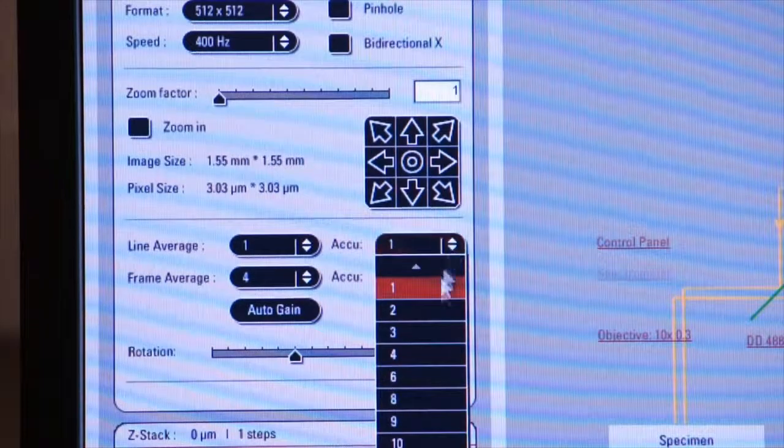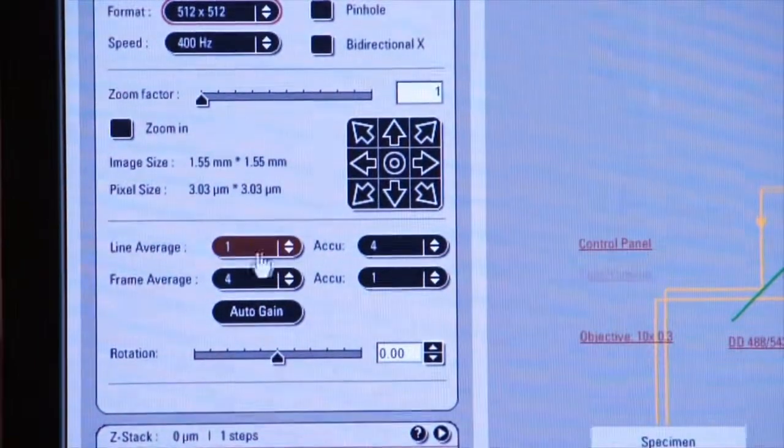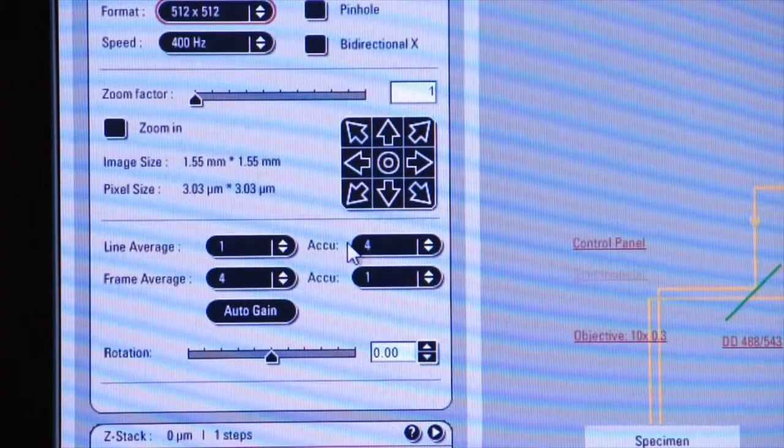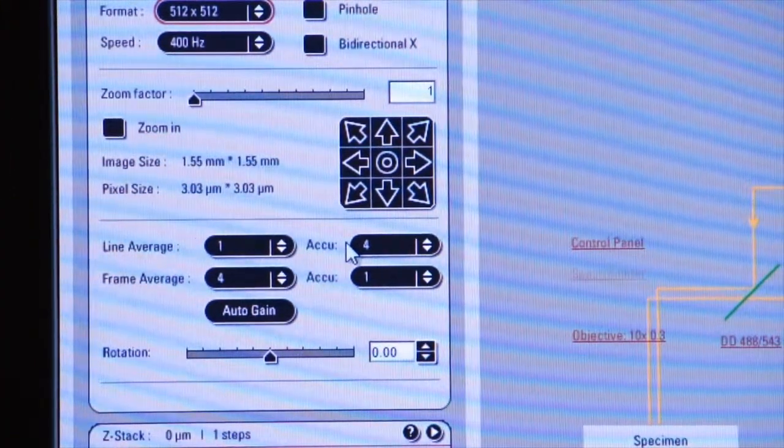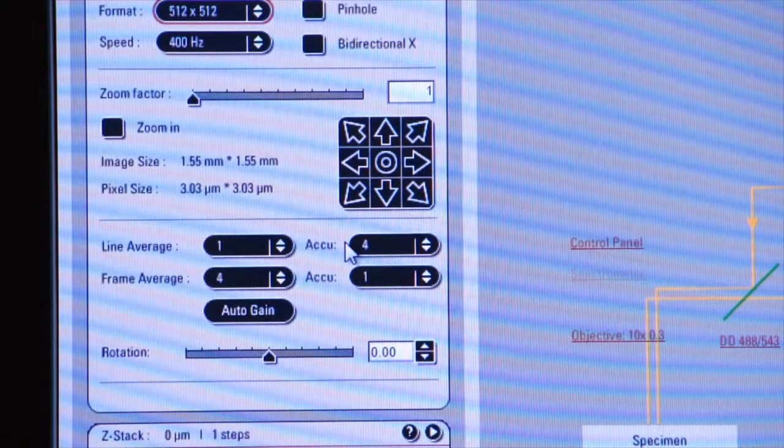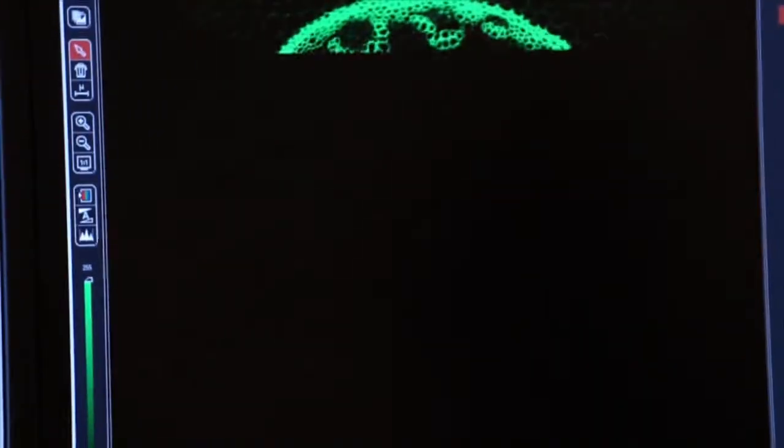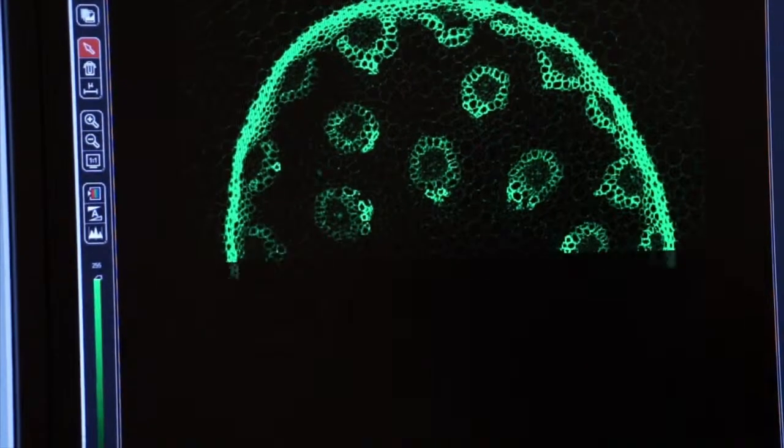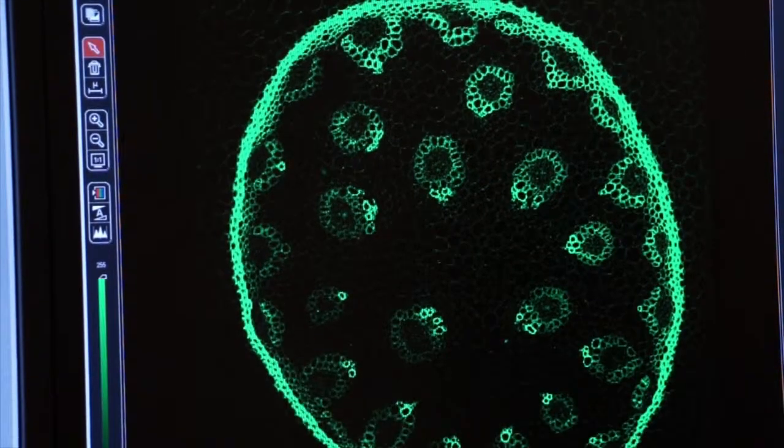So here I'll select four and now I've told the system to do four line scans per line and to accumulate or add together all of those values. Now if I click on capture image, you'll see my image brighten up significantly because it's accumulating each one of those scans together.